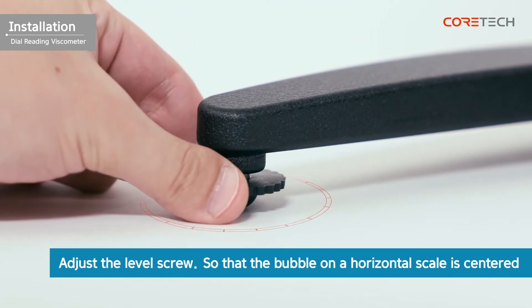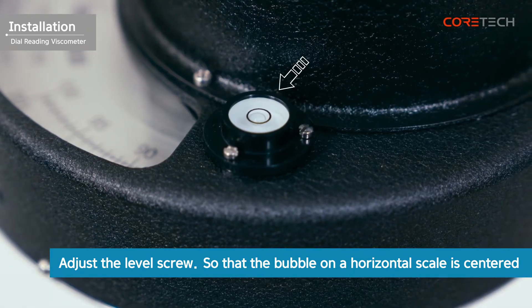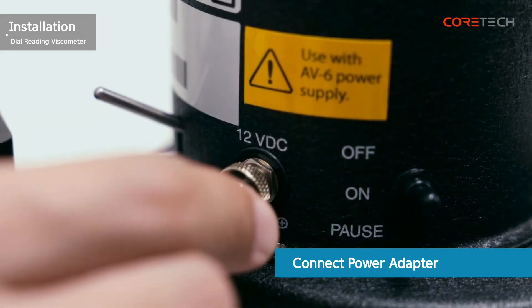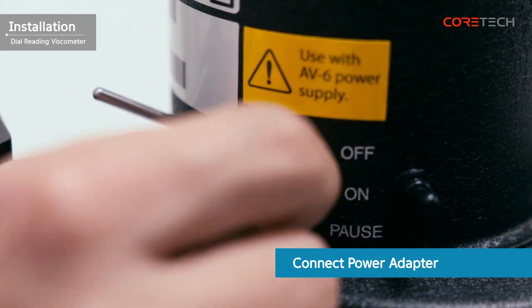Rotate the level screw at the bottom of the stand so that the bubble on the horizontal level is centered. The installation of the viscometer is complete when the power adapter is connected to the power port on the back of the body.